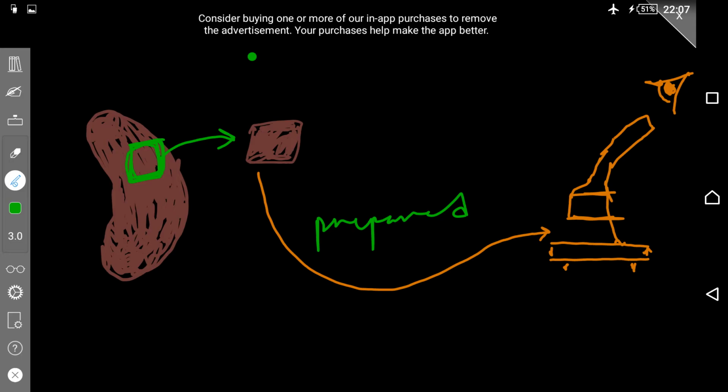This preparation of the tissue for histological examination and study is done through many steps, starting from taking the sample or specimen from the tissue and going all the way to the last part, which is making it on a slide completely ready and without any problem able to be studied.